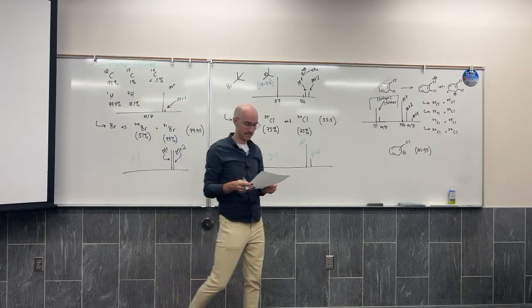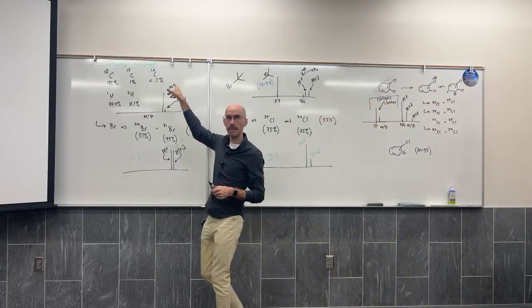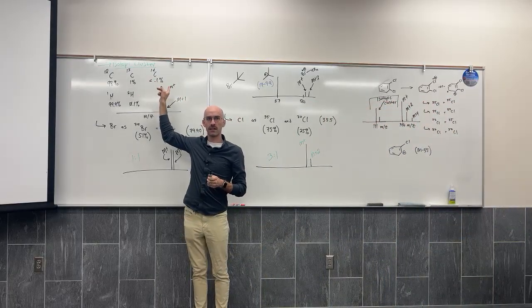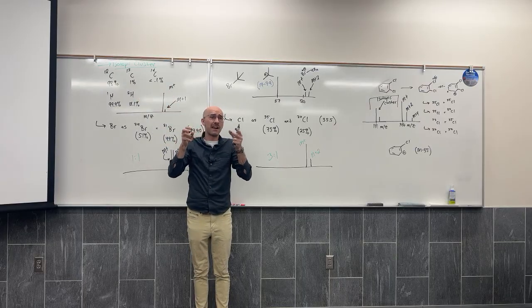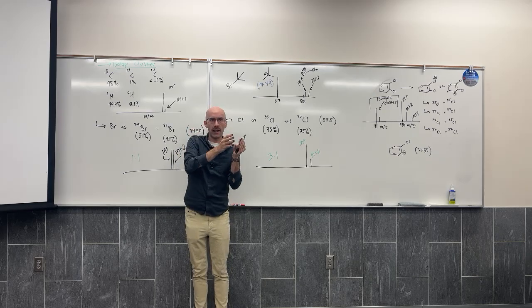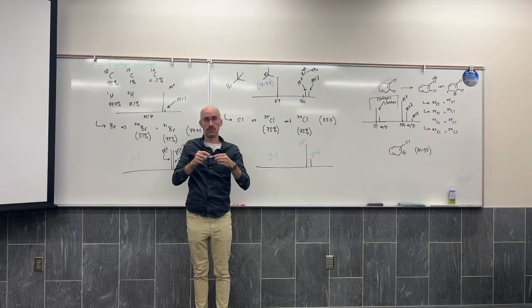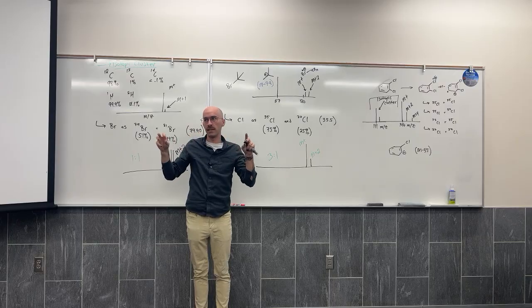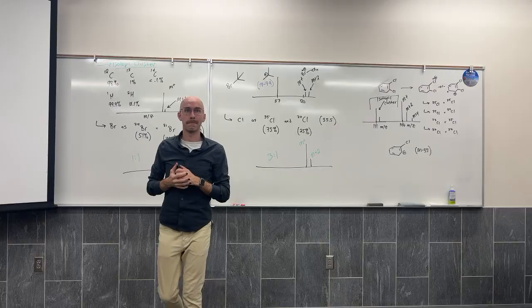What causes the little lines in between, like at 146 or at like 147? Mostly the isotopic clusters that result from carbon and hydrogen. Every now and then, there are heavier isotopes of carbon and hydrogen, and those just change your mass by 1 unit usually. You can notice that there's a ton of little peaks, and we don't look at most of them. So it's just a coincidence that it's organized like that.